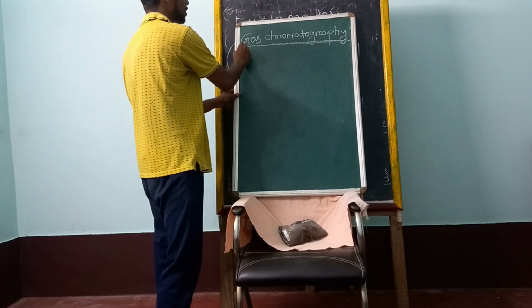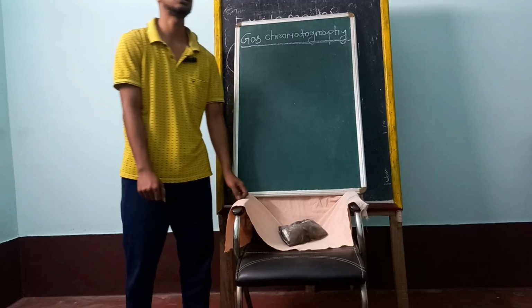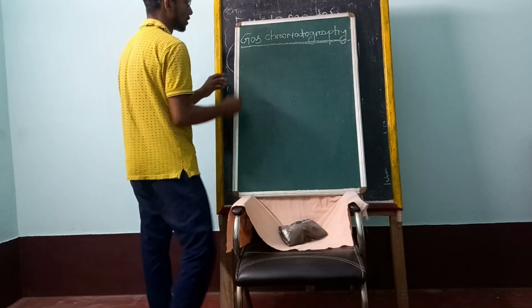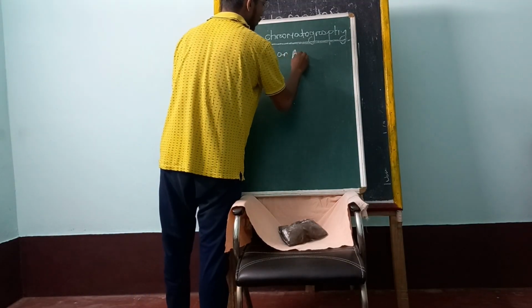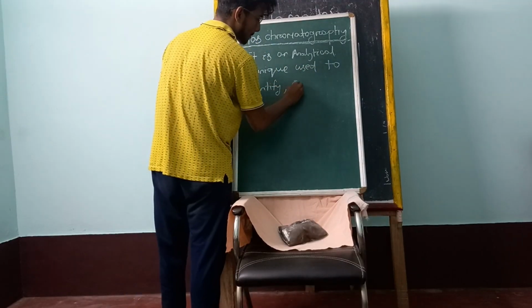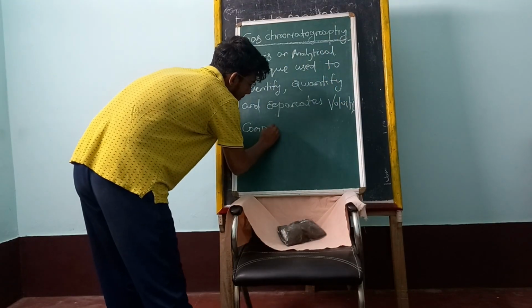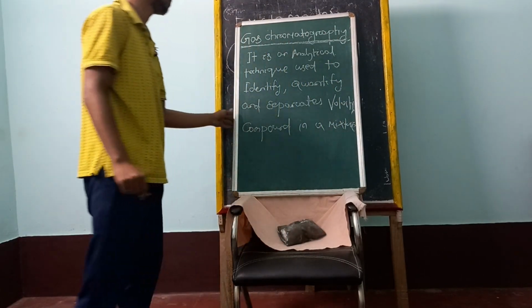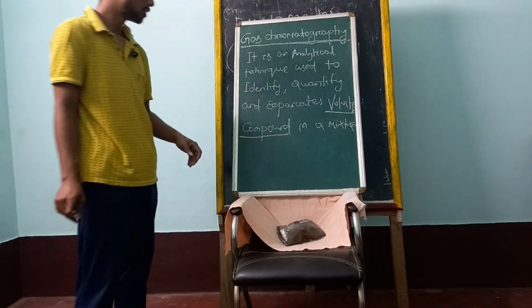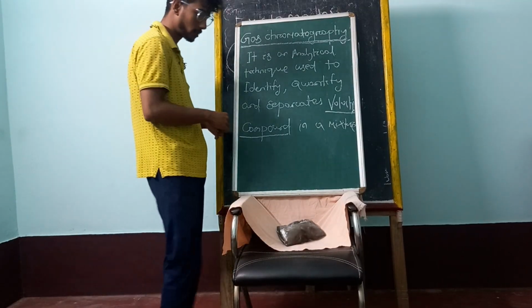I am going to tell you about gas chromatography. Gas chromatography is an analytical technique which identifies, separates and quantifies the volatile compounds in a mixture. And what are the volatile compounds? These are the compounds which get vaporized when exposed to air or to the environment.